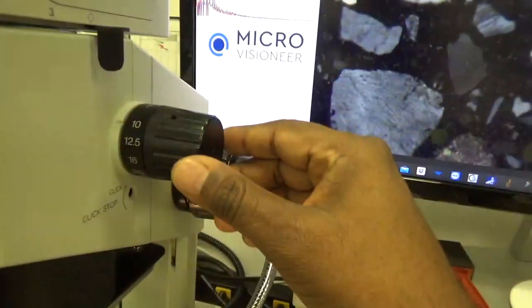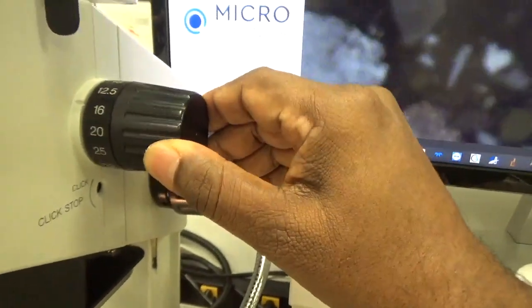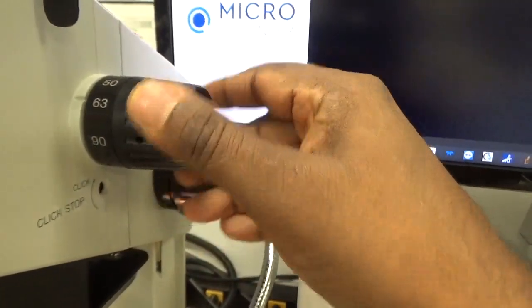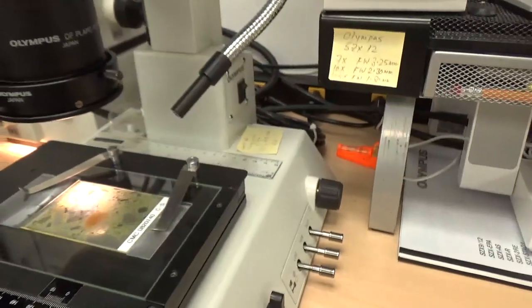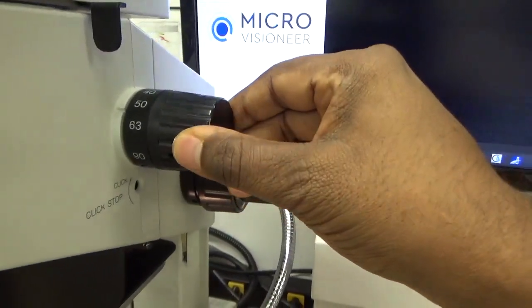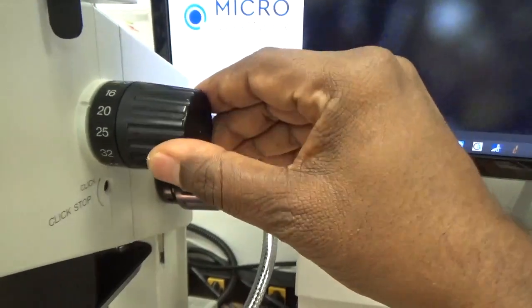This particular microscope goes from 7x all the way to 90x. But the higher the magnification, the longer it takes to scan the thin section, and the file size of the scanned image increases significantly. We usually stay at 10x magnification.